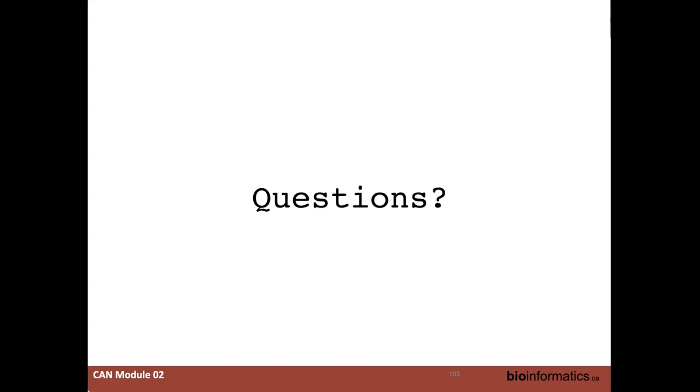Okay, so if they only give me the FASTQ files, that information is not there, right? If they only give you FASTQ, that is correct. That is not there at all.